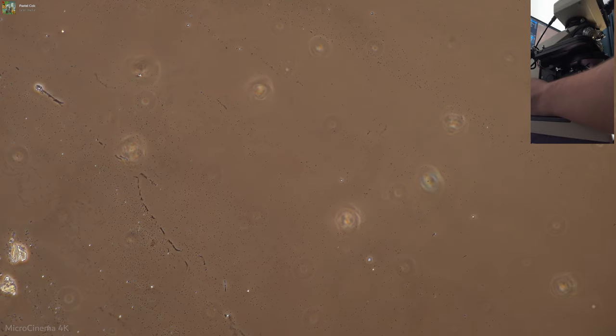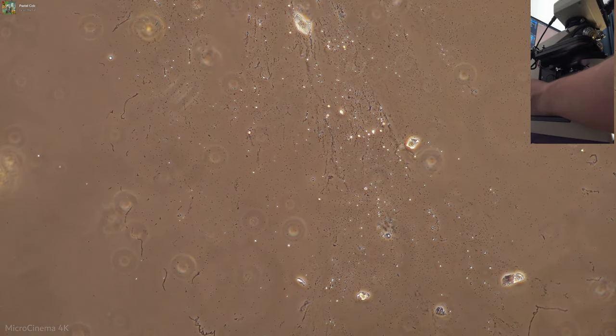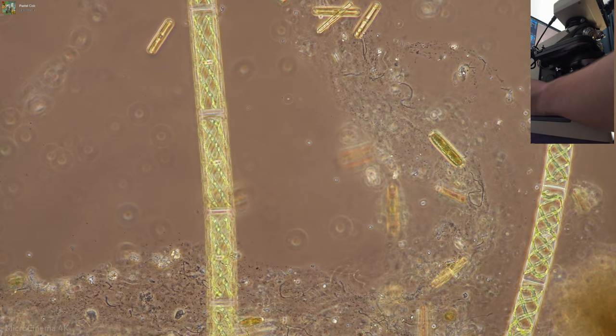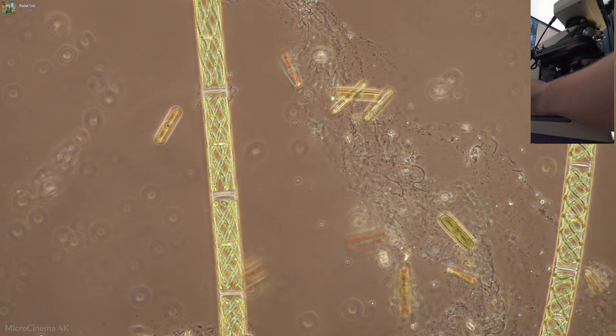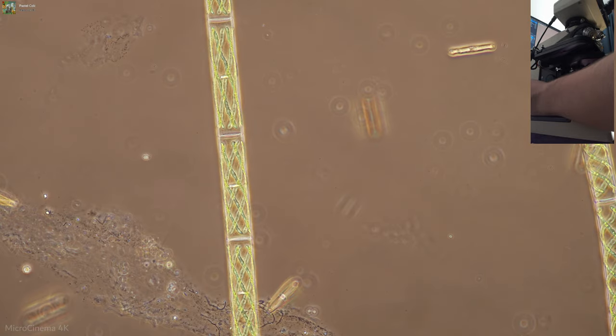I think anyone with a DIC slider that works similarly ought to kind of give this a shot, see if there's a way to do this because it's just so cool. So I've never seen the Spirogyra with the phase contrast and I kind of love it. It looks cool.